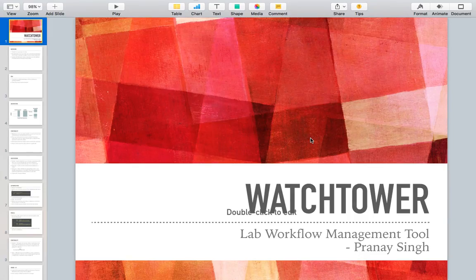Alright, so this is my project, which is a lab workflow management tool called Watchtower. So now, why did I build this? After doing some research in the lab and speaking to some lab researchers, I found out that there's actually one very big problem which hasn't been solved, and that is the problem of tracking and journaling.